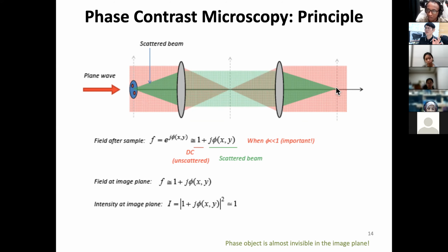And here's the deal. Now, why don't we try to make this a simple mathematical formulation? Okay, the field, let's focus. We are dealing with electromagnetic waves, so we have to think through the field first, but remember in the imaging process, we are only seeing the intensity. So ultimately, the field magnitude squared gives an intensity distribution that we call an image.